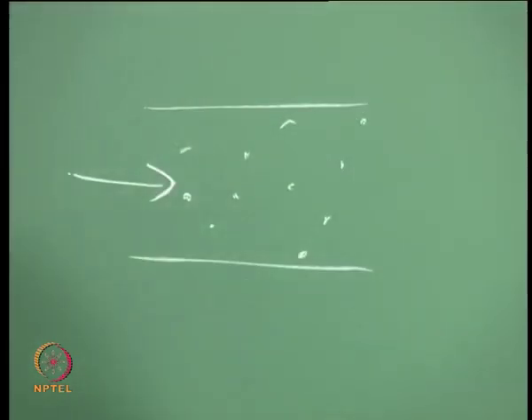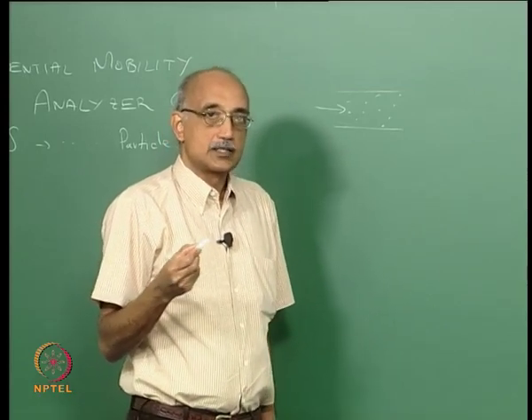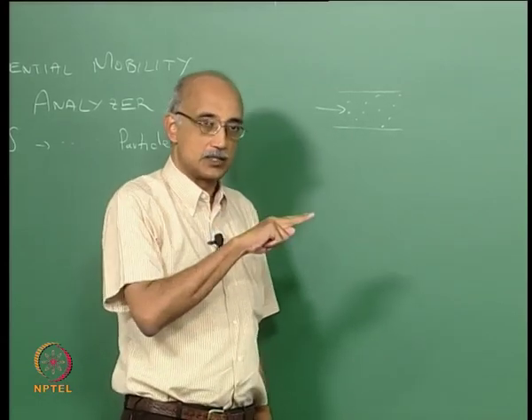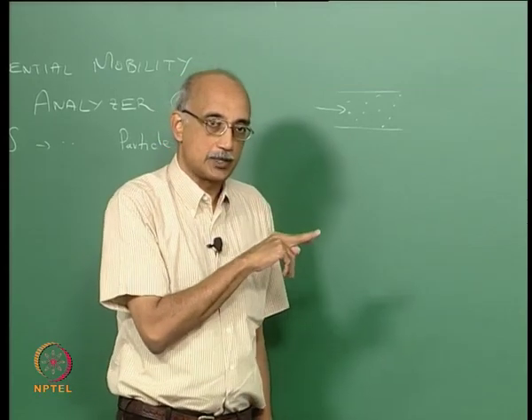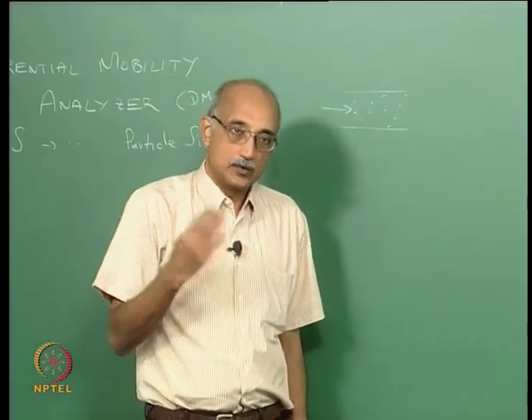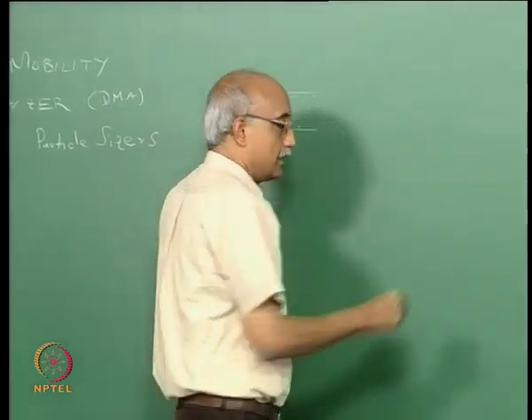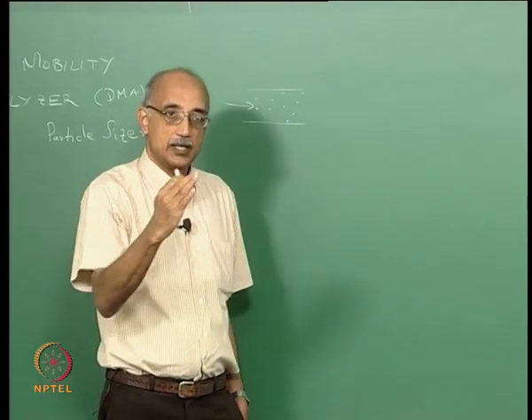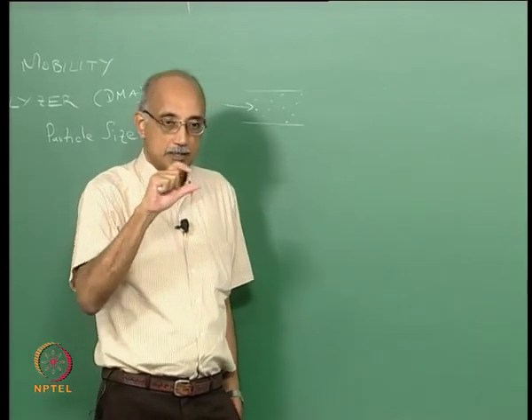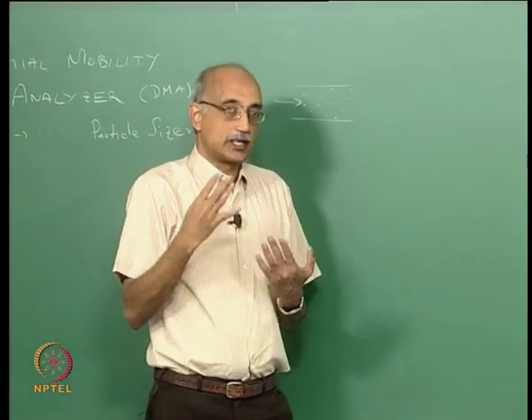You may recall that we had looked at a similar setup in the larger particle size ranges where we looked at cascade impactors. If you remember, the principle behind a cascade impactor is almost the exact reverse of the principle behind a diffusion battery. In a cascade impactor, you take advantage of the fact that larger particles have greater kinetic energy. So, again, if you use a set of screens, the largest particles will most likely be captured in the first screen itself, and then the smaller particles will be successively accelerated to greater velocities by narrowing the diameter of the chamber to improve their capture efficiency.